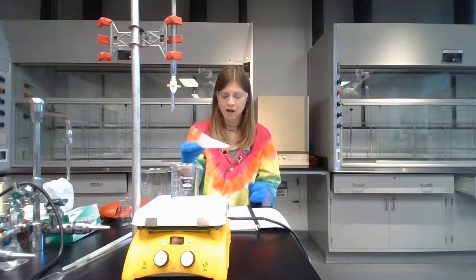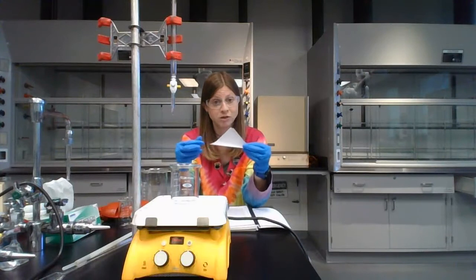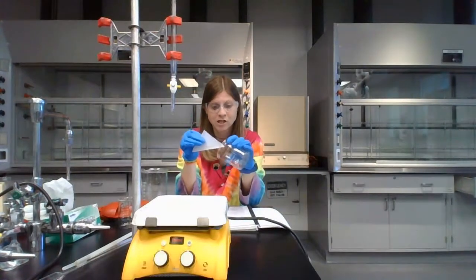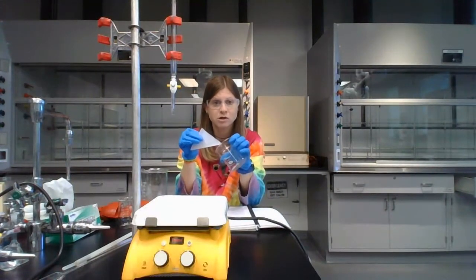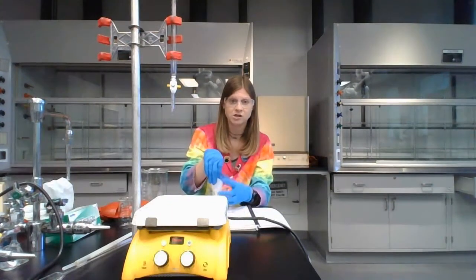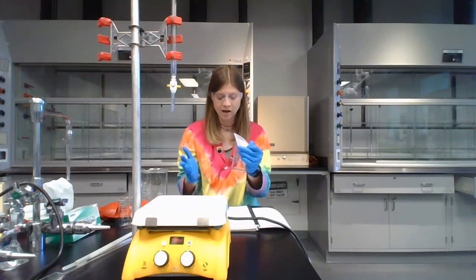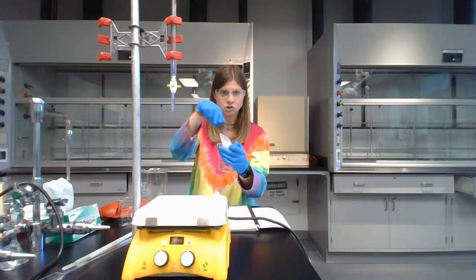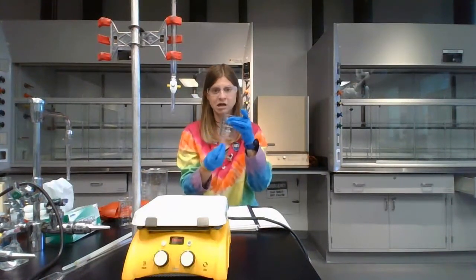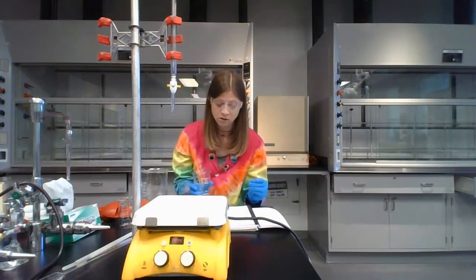You will start by measuring out between 0.1 and 0.15 grams of sodium oxalate onto a piece of weigh paper. Then you will transfer that solid, using the weigh paper, into a 250 milliliter beaker. We're going to be using beakers instead of Erlenmeyer flasks for this. To rinse the weigh paper, you will use the sulfuric acid, about 100 milliliters in total. Just pour it down the weigh paper to rinse all the solid out. Now we have 100 milliliters of sulfuric acid and our 0.1 to 0.15 grams of sodium oxalate, where you accurately recorded the mass in your lab manual.